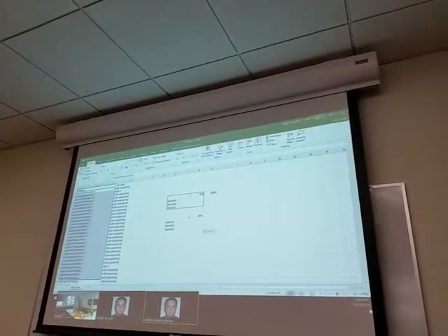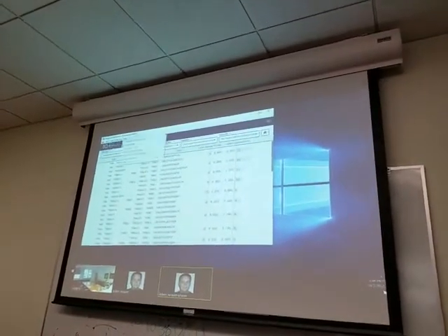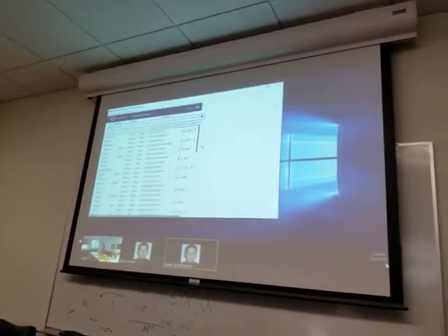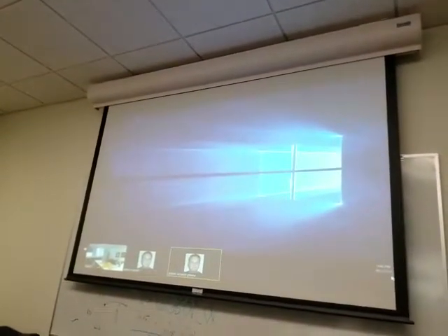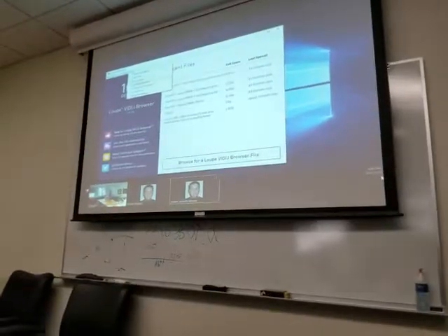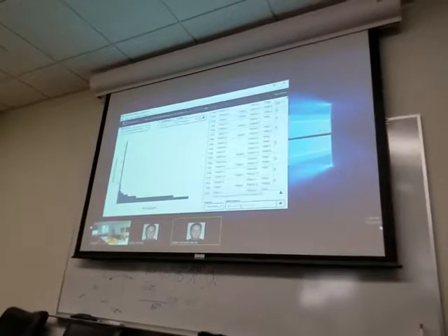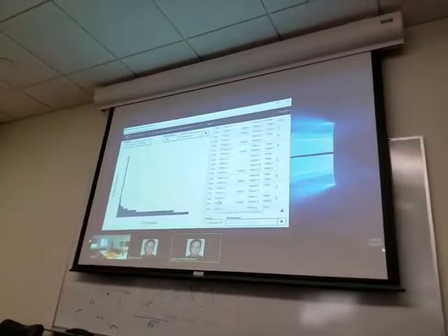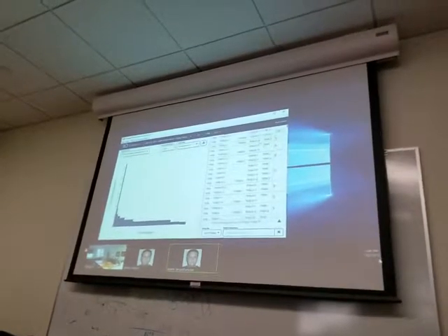There's some stuff you can look for using the browser. You can find mutations at an individual level, but just reopen this. So you can see down here, CDR3 amino, you can put particular amino acid sequences for actual nucleotides as well. So if you're looking for a particular motif, you could search for that and find it in here.